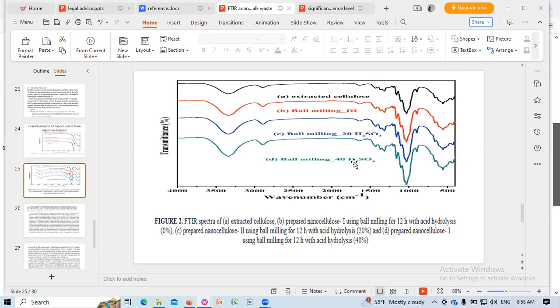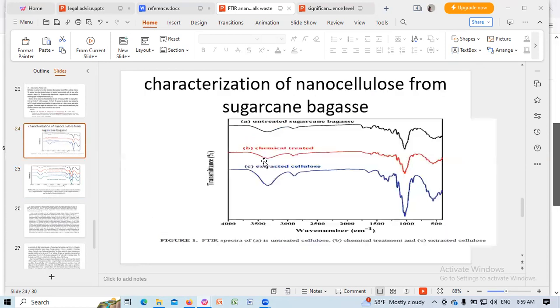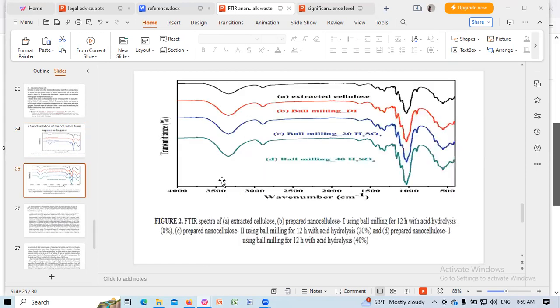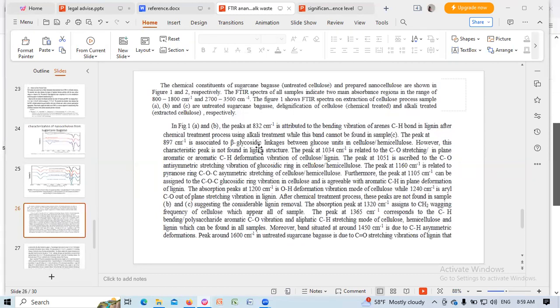2900 per cm, the CH stretching vibration, CH stretching vibration. 3340 per cm, OH stretching vibration of the OH group in this area. This is the explanation of the FTIR spectra.